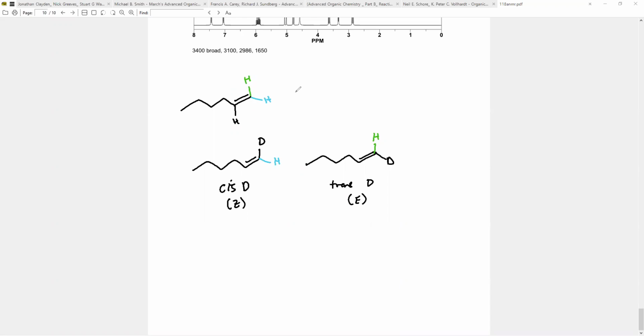All right, so we would expect these hydrogens to be different. So this hydrogen talks to this guy, and he talks to this guy, right? So this blue H here would be about a doublet. So it'd be a 1H doublet. This guy here talks to, again, this guy, that talks to this guy as well. So on the green 1H, we get this.